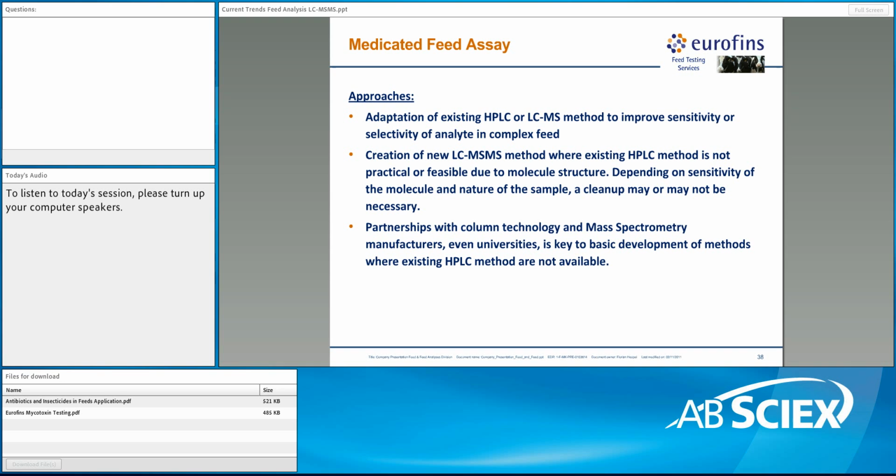Another approach, obviously, is the creation of an absolutely new LC-MS/MS method where there's no existing HPLC method. And that's a little bit more challenging, obviously, although the sensitivity of the newer instruments would likely allow fairly simple methods to be developed using standard simple extraction and little to no cleanups.